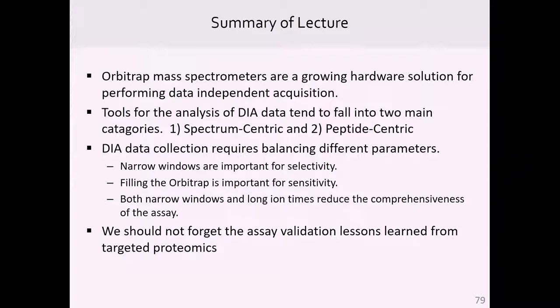This is a really long answer, and so I wonder if we can get to it on Thursday. On Thursday, I'll point out that I don't think DDA is the best way to generate a library. There is a simple way of generating a DIA library from DIA data from just about 6 injections on your actual samples. That gives you a lot of power on your actual samples, on your column, on the same day, on the same instrument, and it takes just 6 injections. And there we are able to detect about 90% of the things that are in the library in the wide window runs that we do later.